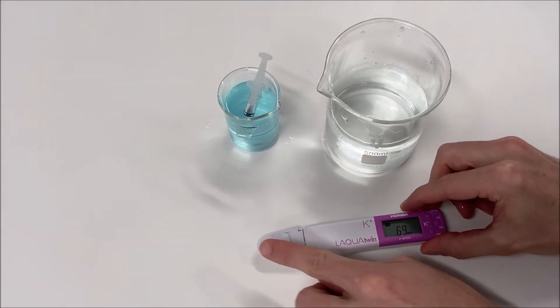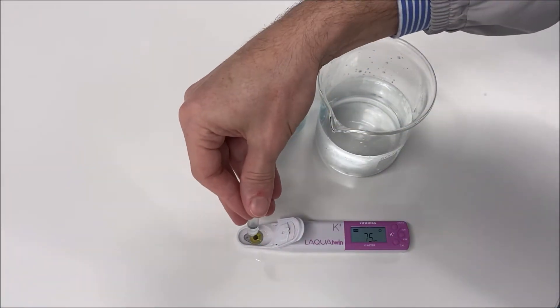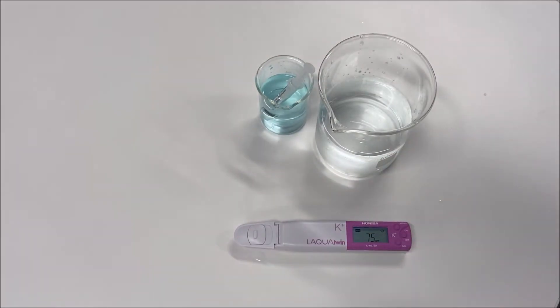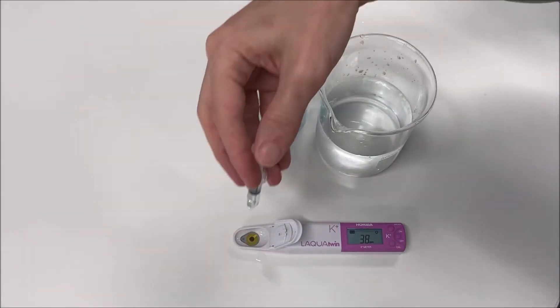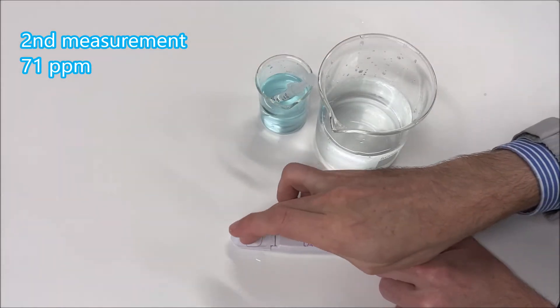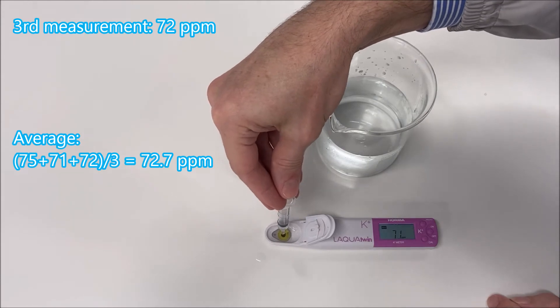Then pour your new sample one more time on the sensor and wait for the smiley face to be displayed. When a sample is heterogeneous or has a paste consistency, you can take multiple readings to calculate the average concentration of the sample. We recommend averaging three results for the best precision. In this case, you don't need to clean or pre-wash the sensor between each reading.